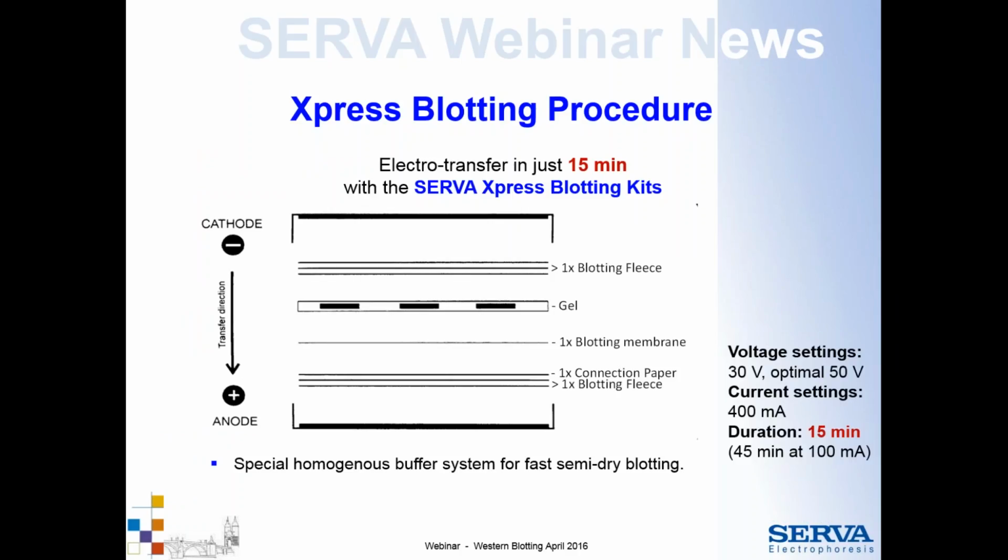So this is a picture of the blotting stack. You will see that instead of the blotting papers, there is blotting fleece on the cathode and the anode, and between the blotting fleece at the anode and the blotting membrane, there is so-called connection paper to ensure optimal blotting performance. So this is a special homogeneous buffer system for fast semi-dry blotting.